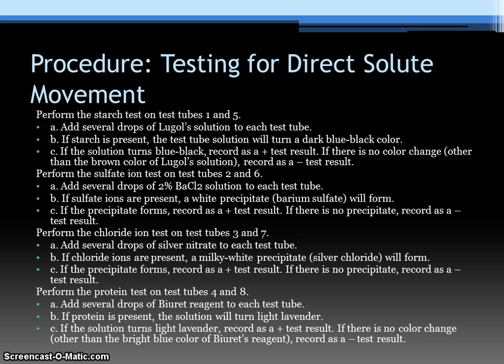After that, we would perform the sulfate ion test on test tubes 2 and 6.